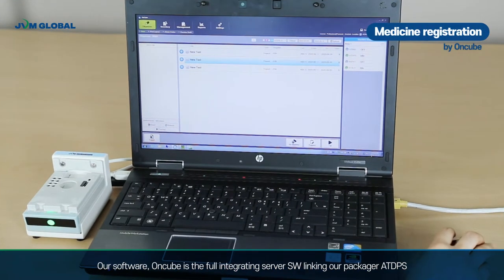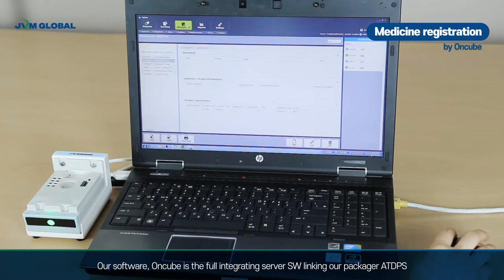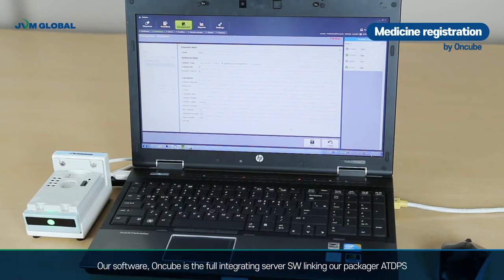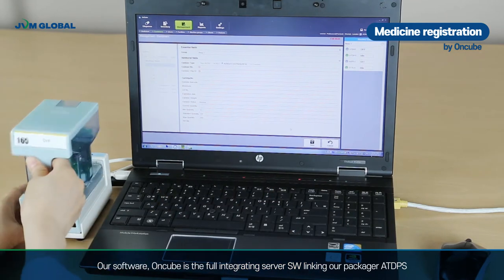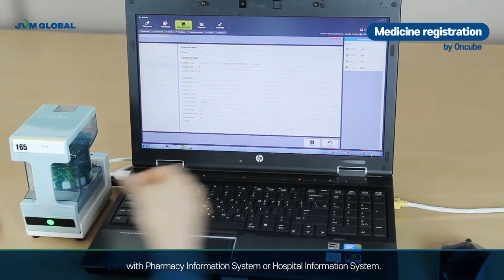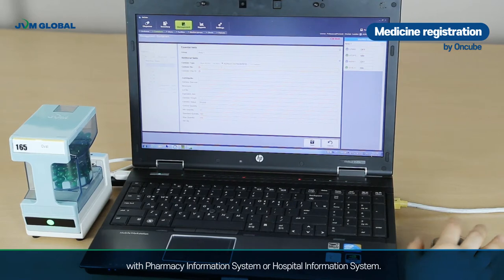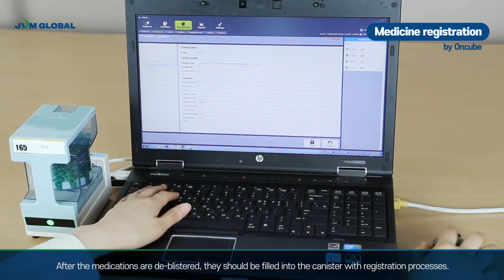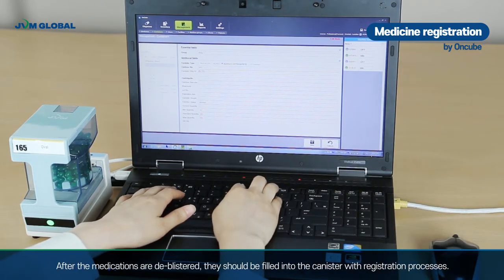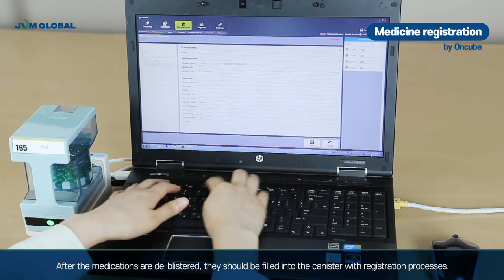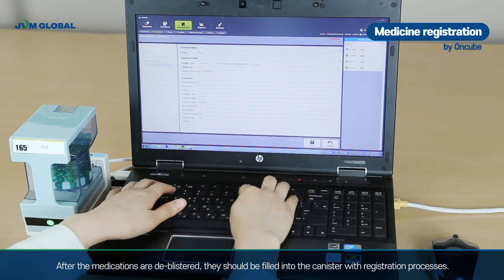Our software, OnCube, is the fully integrated server software linking our packager ATDPS with the pharmacy information system. After the medications are de-blistered, they should be filled into the canisters with registration processes.